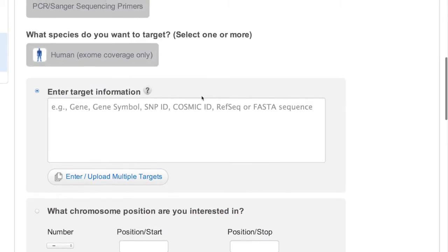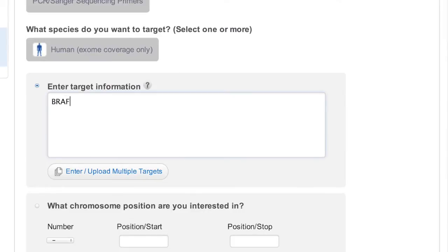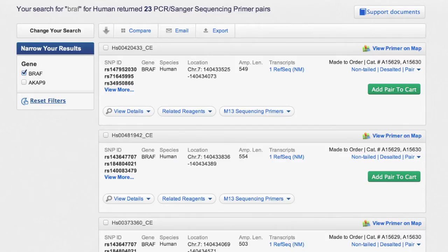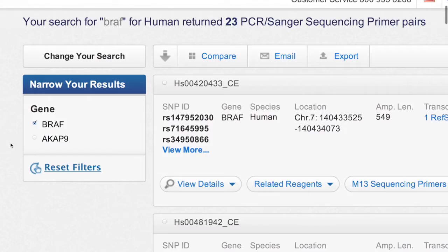Let's start our search with BRAF. These results show that there are 23 primer pairs available for the BRAF gene. You can also see that a second gene, AKAP9, is included along with its corresponding primer pairs when selected. The AKAP9 gene description contains the word BRAF because the fusion protein BRAF-AKAP9 has been described in literature.